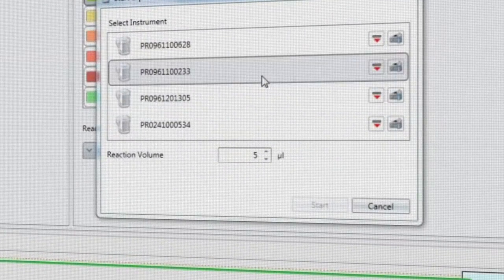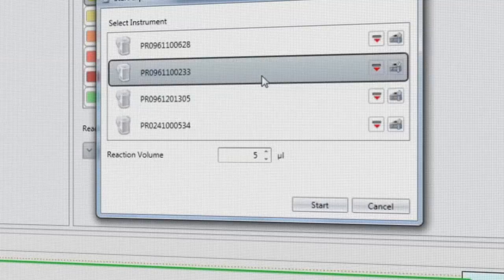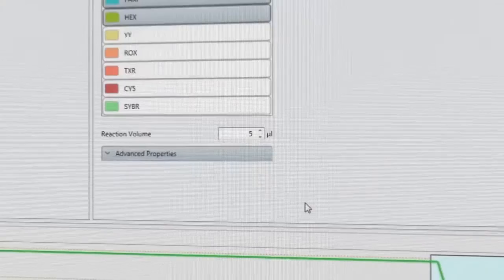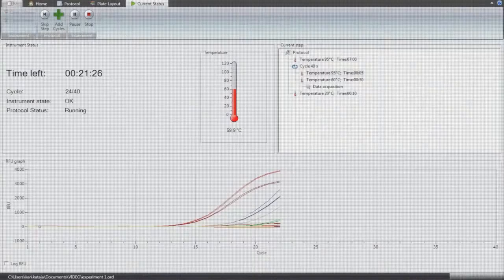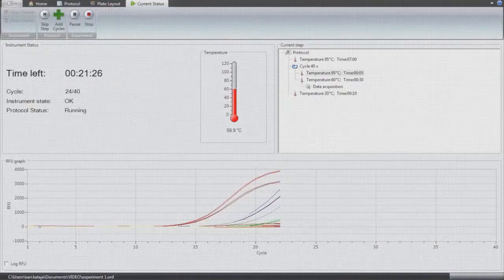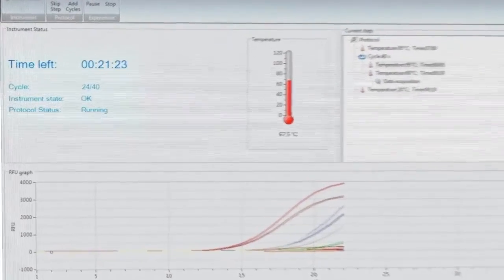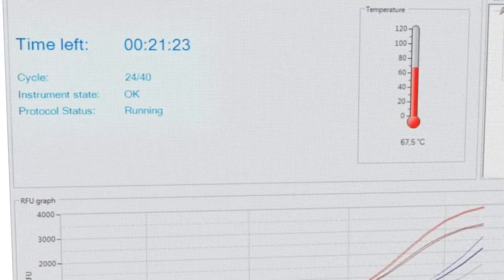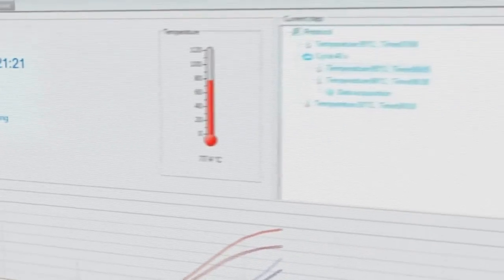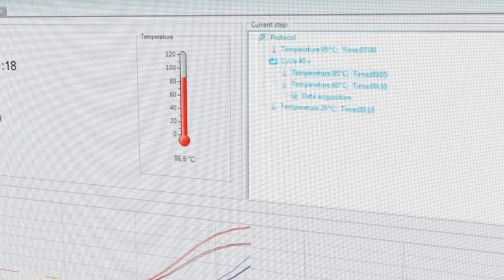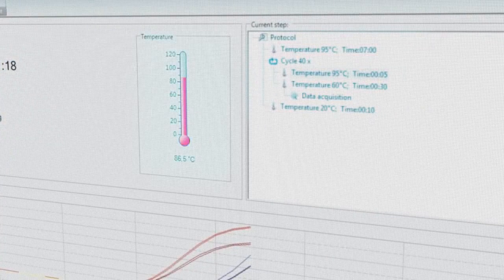The PicoReal software can control and run several instruments at the same time. The monitoring of the runs from the software run screen gives information of the current state of the protocol, remaining time, active protocol step and current temperature.